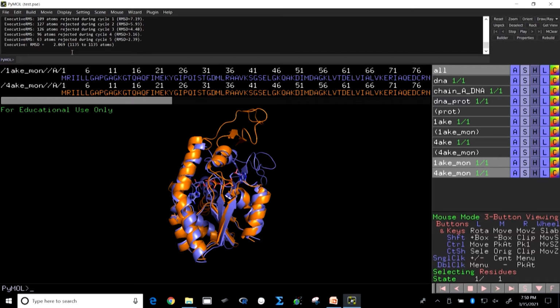So, I hope you have understood and taken a very important lesson from the current study, that whenever you want to compare two structures, you will never do that in their dimer, trimer, tetramer, that means oligomers. You always do the first initial step: you convert the oligomer to monomer and then compare the two monomers.